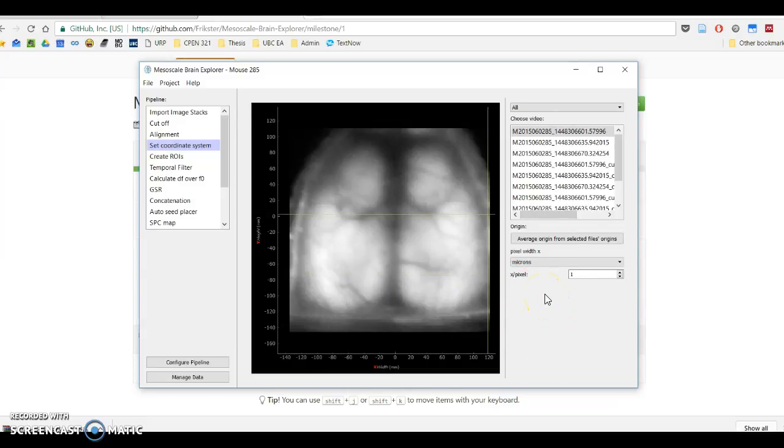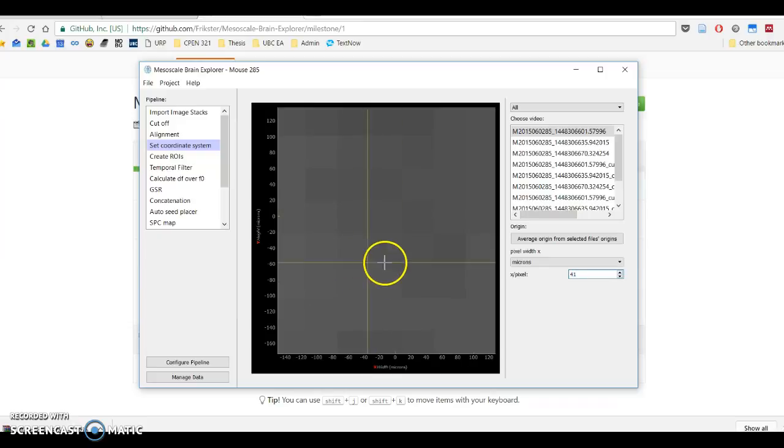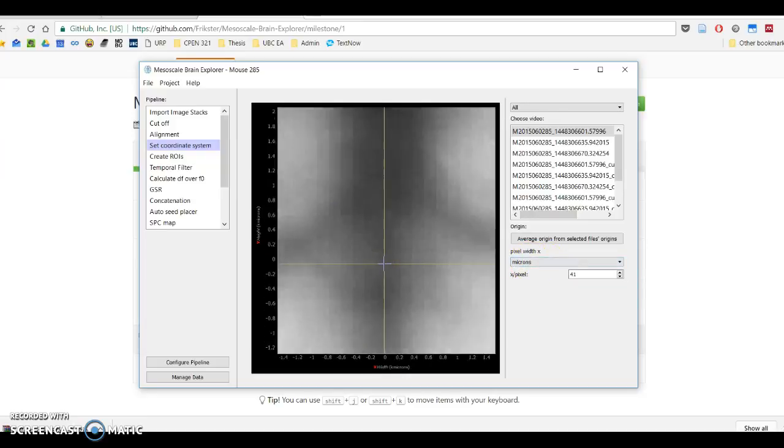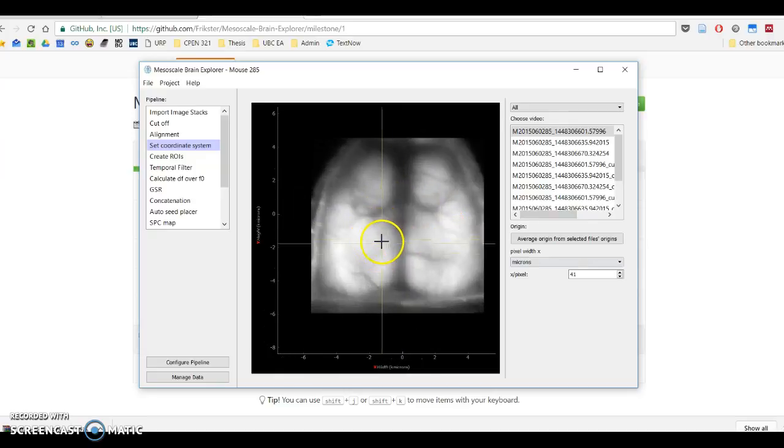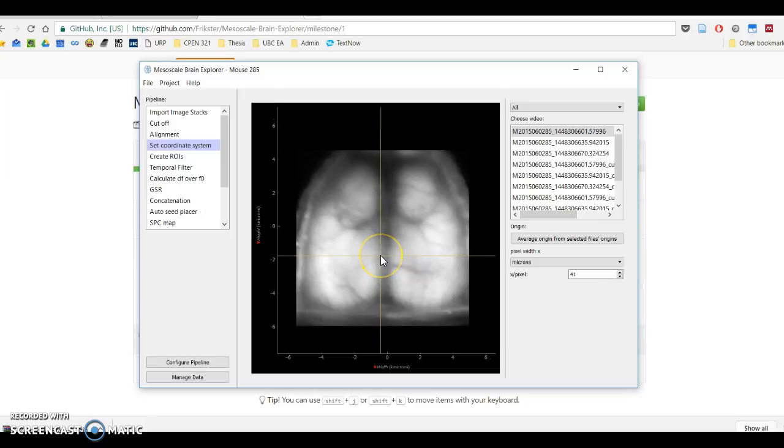So the next thing you want to pick over here is your pixel width. So we know, for instance, that each pixel is 41 wide. So you can see here what I've just done is if you look at a single pixel, from there to there, there's now 41 units between the two. And as we've said, we've picked 41 microns. If we zoom out, and that looks nicer.